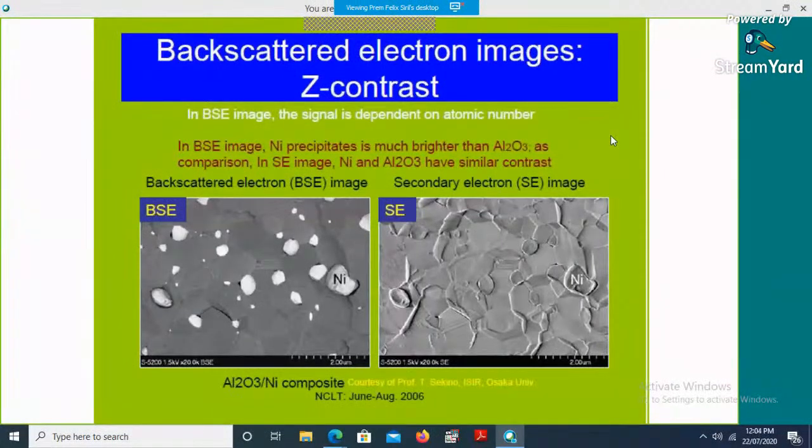Yes. Actually, they are complementary, and they can be used especially for a composite material. For example, if you have two or more different types of material present in the same sample, that is the case in mixtures and composites.